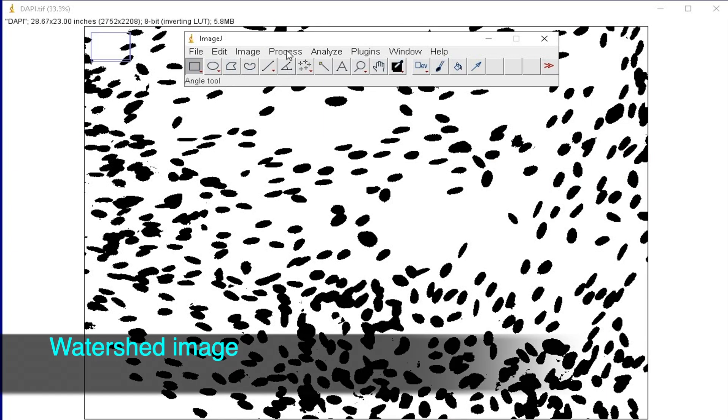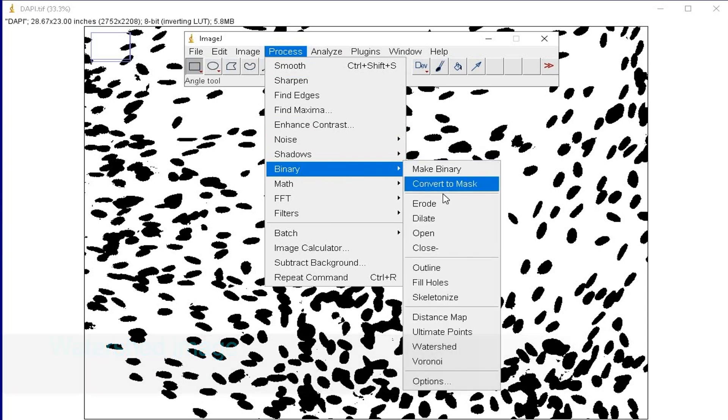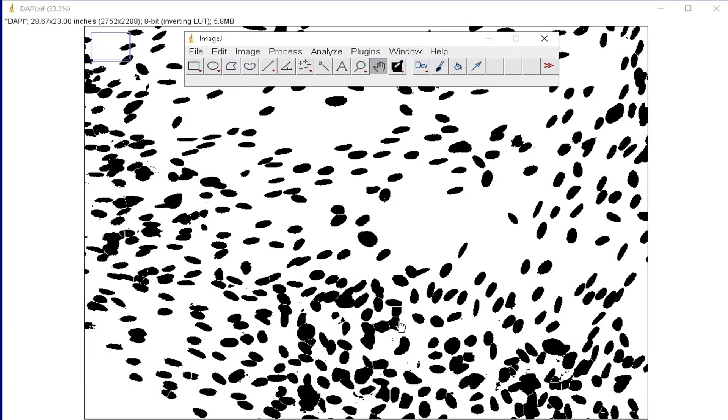This is achieved by watersheding the image. To do this, click on Process, Binary, and Watershed.